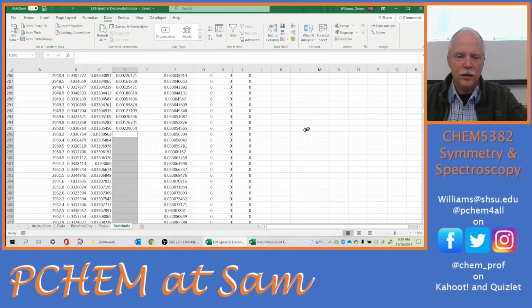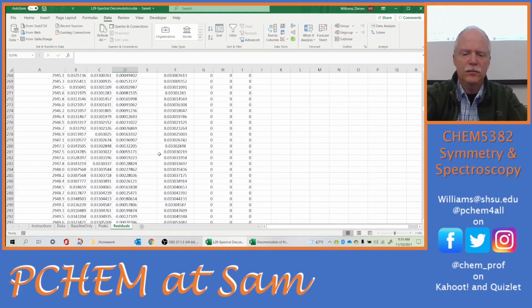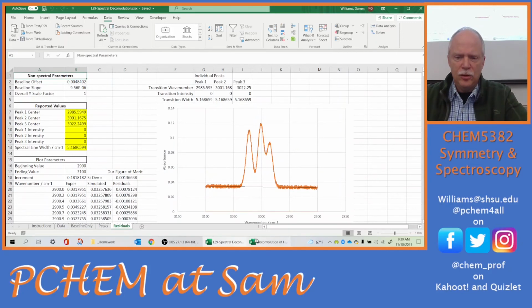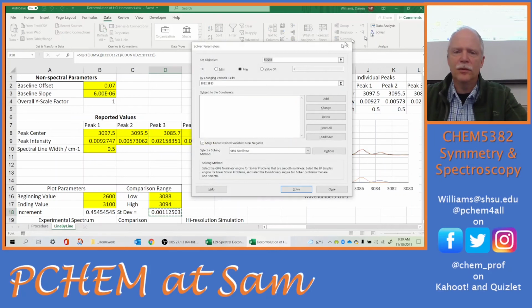Okay. Whoa, why did it jump to the other spreadsheet? Because you deleted those. It didn't change this. Go back to the one and look at solver. All right, let's do solver again. Maybe it was referring, see, D18, that's correct. We just go ahead and select it. I mean, I see that it's selected, but no. Let's do D18 by changing B2 and B3.